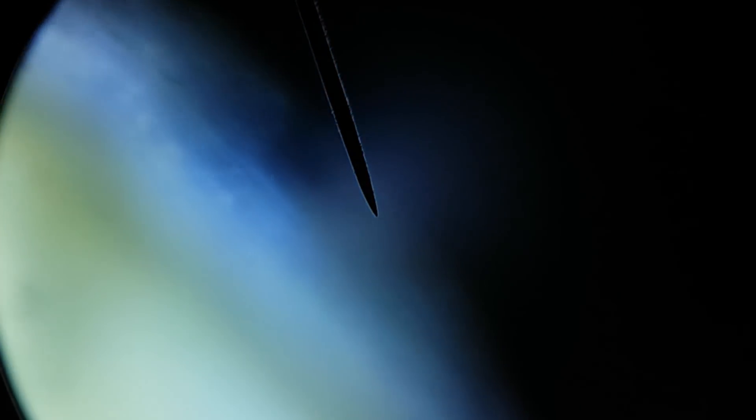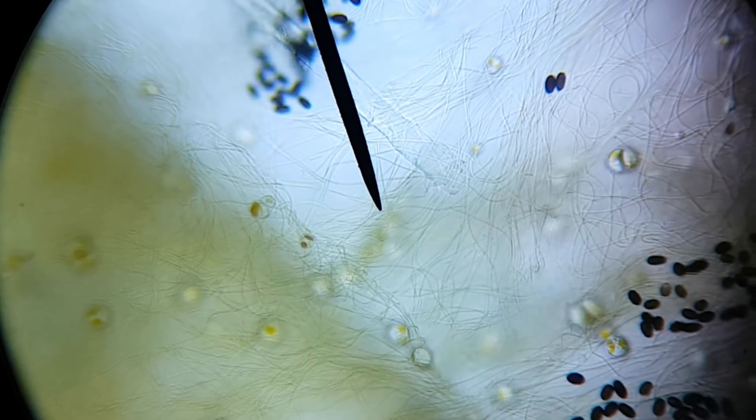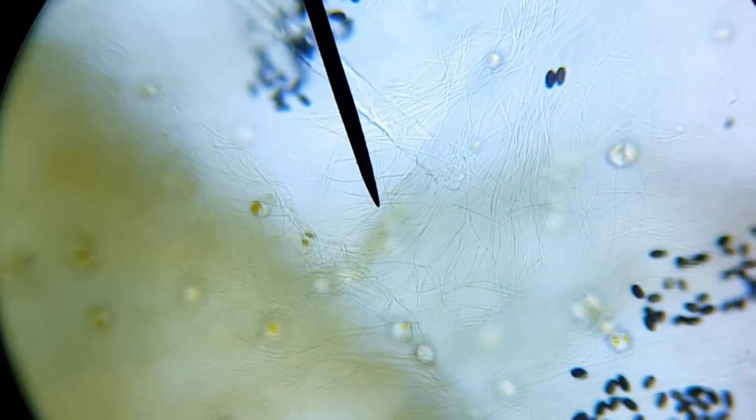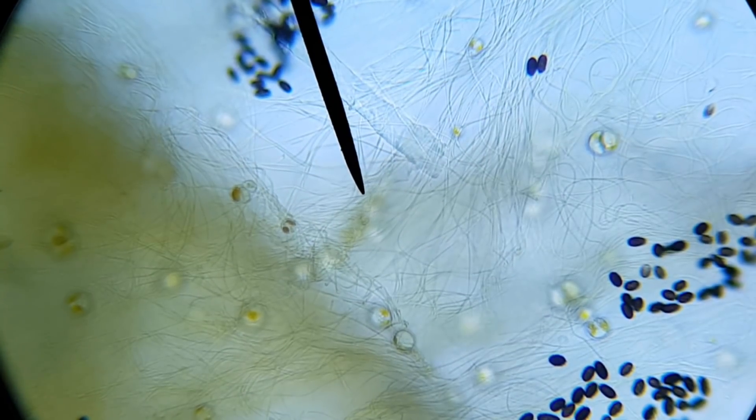Oh no, not again. Look at all those black things. I wonder what they are. Also, ignore me trying to reattach the camera.